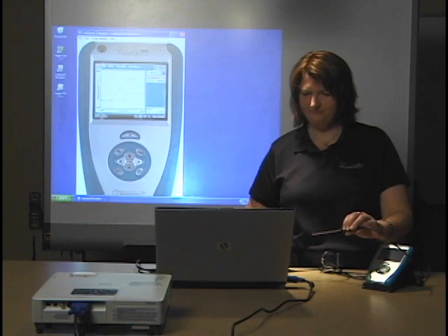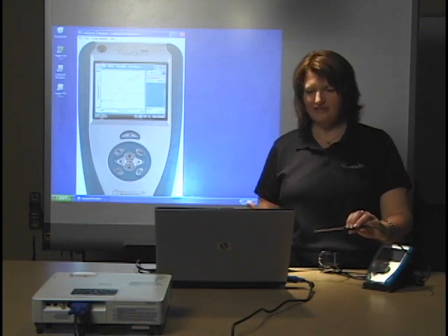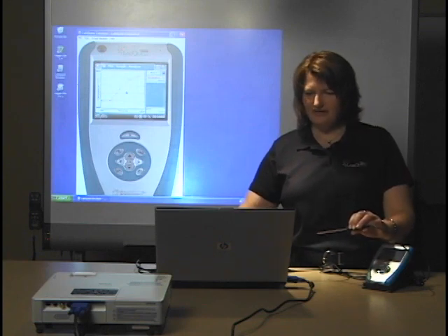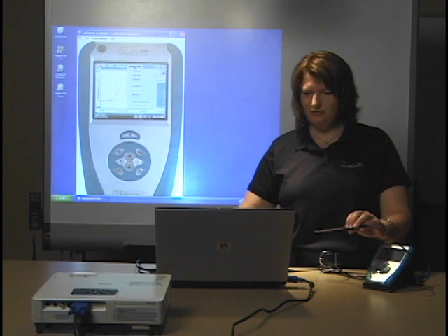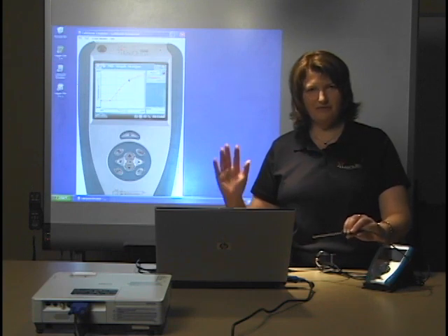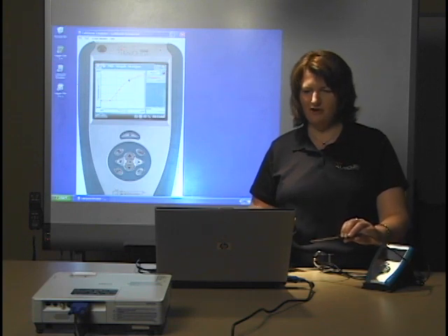I'll stop that. There's our data. You can do any of the same things you would normally do with your LabQuest, but it is through the emulator software and being displayed on the wall.